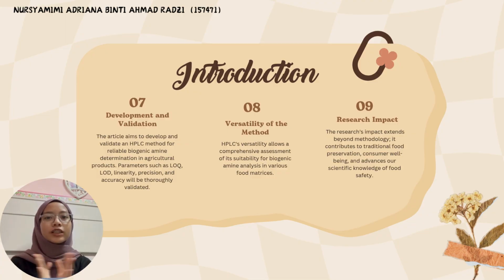techniques. So our article focuses on the development and validation of a reliable HPLC method for accurate biogenic amine determination in agricultural products. It also evaluates the method's suitability for biogenic amines analysis in a variety of food matrices, traditional food preservation, customer satisfaction, and also the advancement of food safety knowledge.